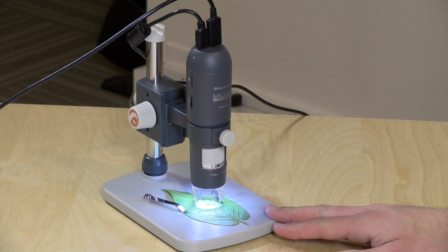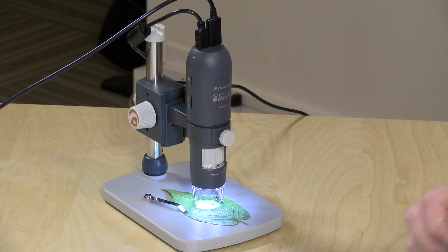Hey everybody, it's Lon Seidman and we're taking a look today at a microscope. This is the MicroDirect from Celestron and it outputs its imagery at 1080p at 30 frames per second.